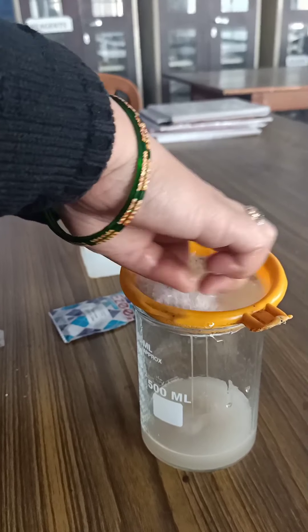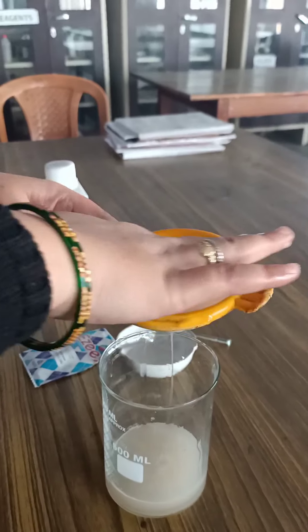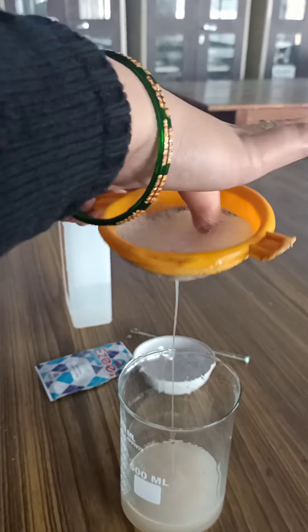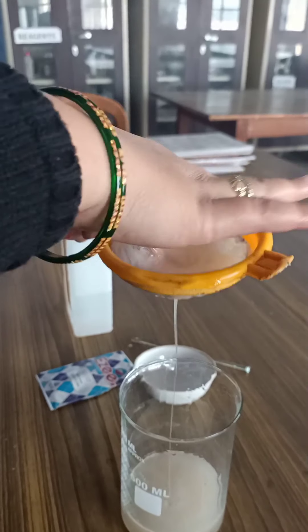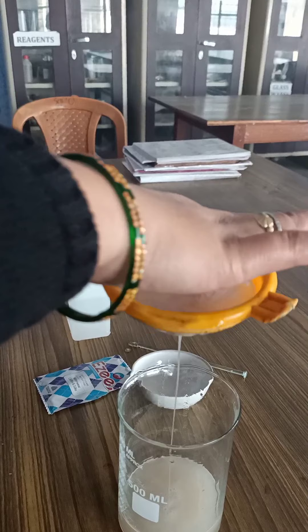You can use your hands, and if you have a blender you can use that too — we don't have a blender here so we are doing it manually. Now the banana has been mashed completely in the solution.